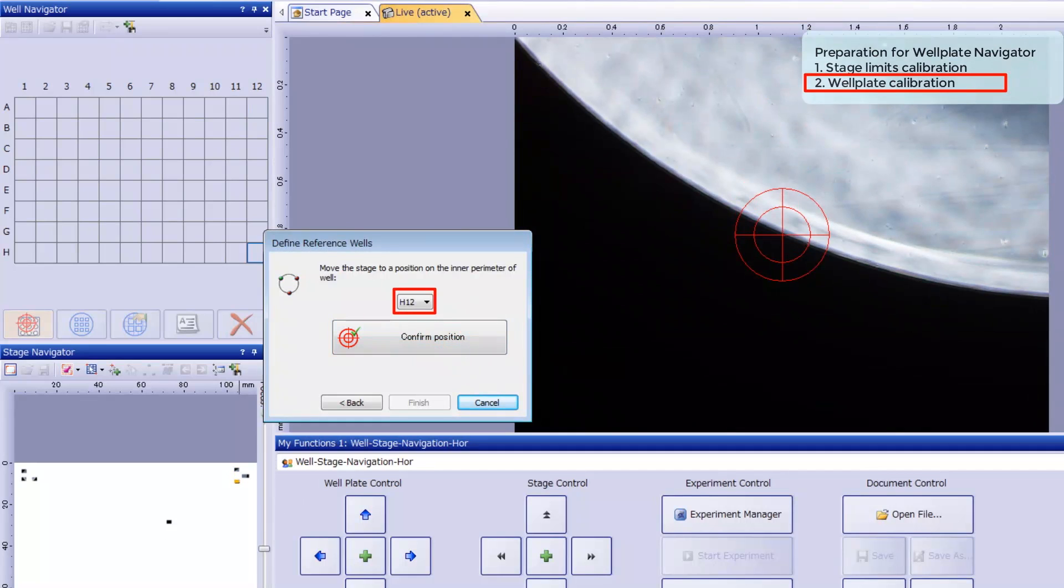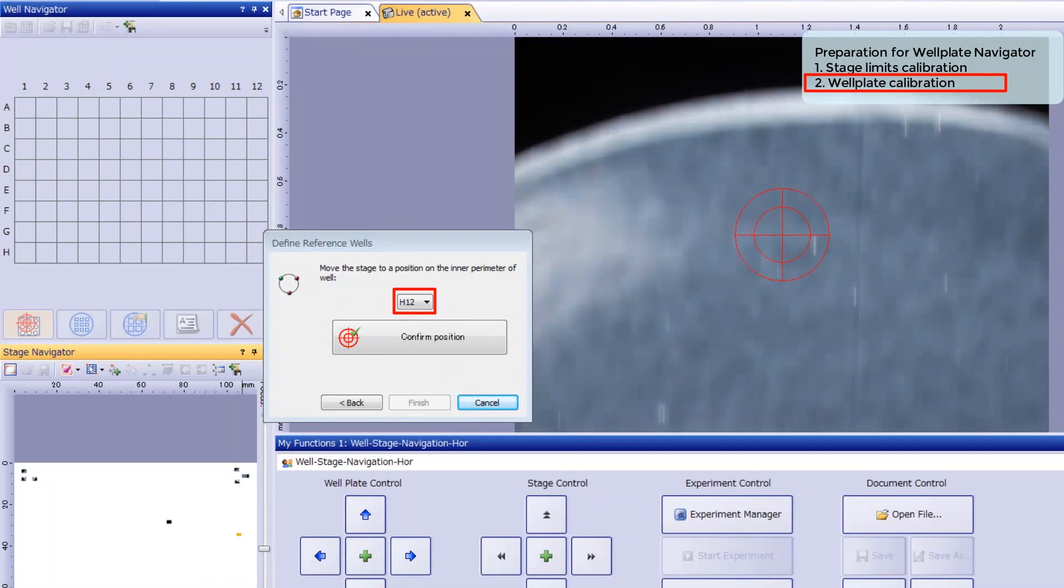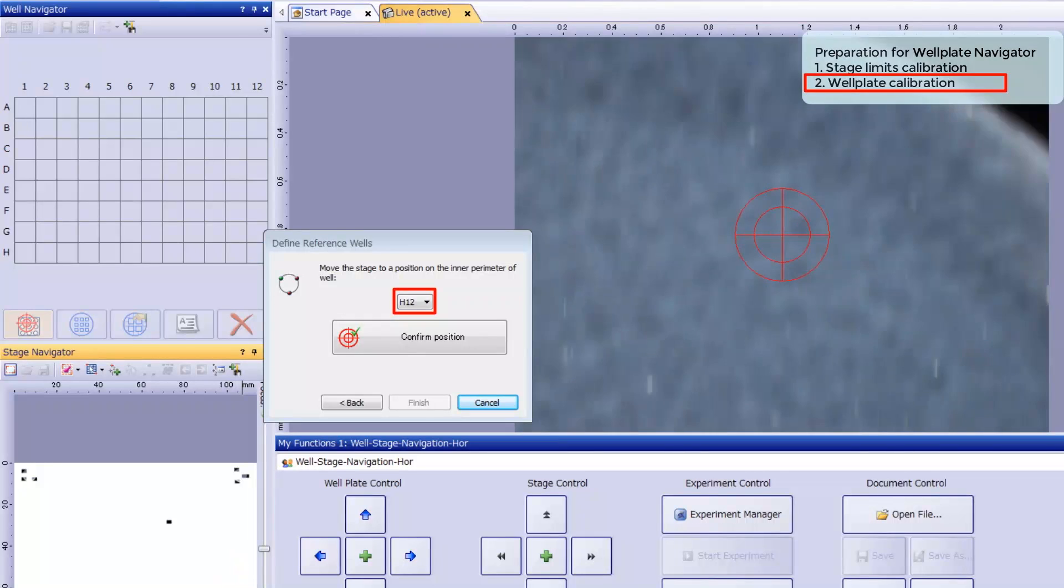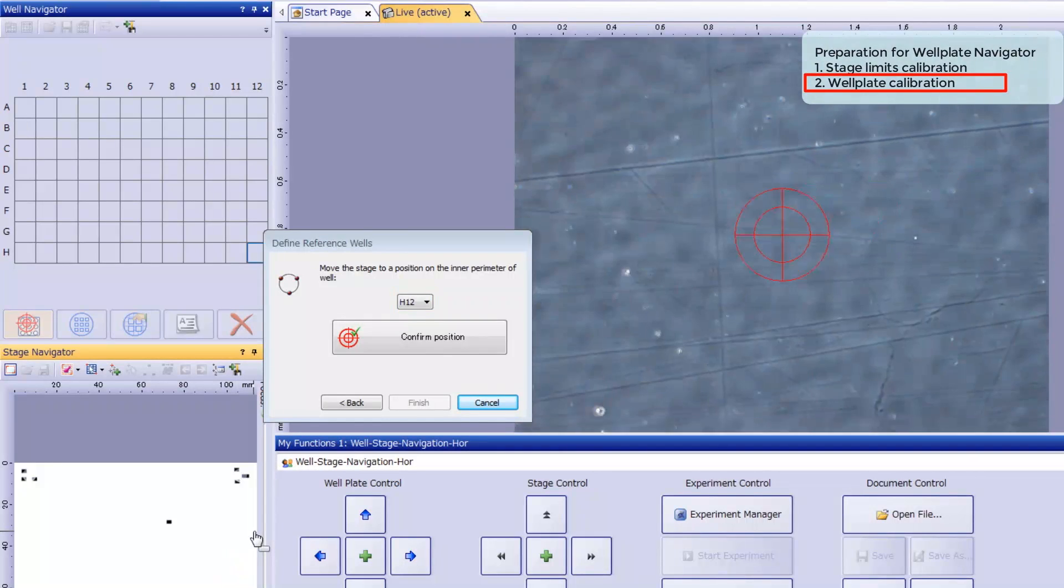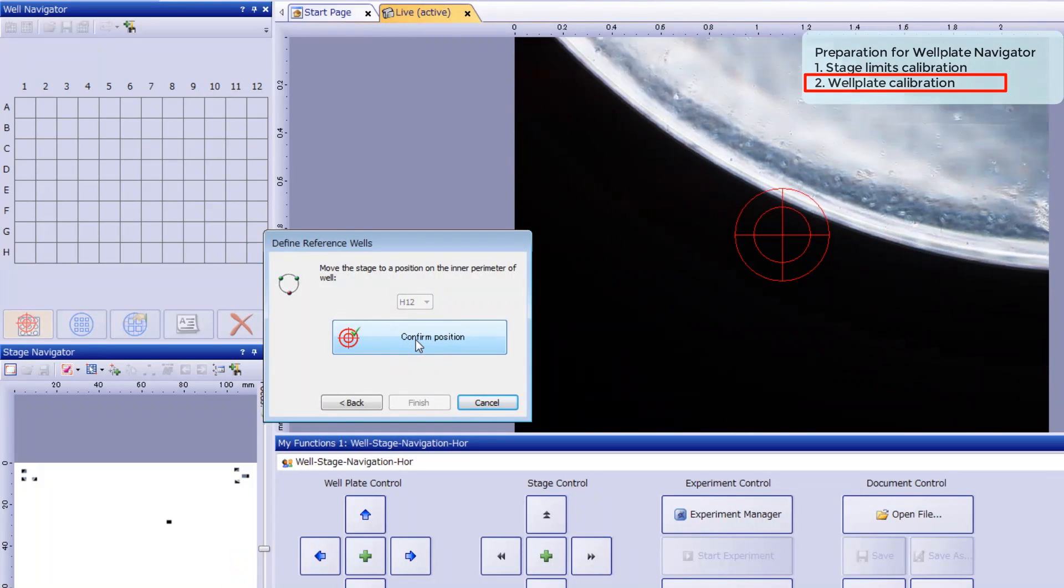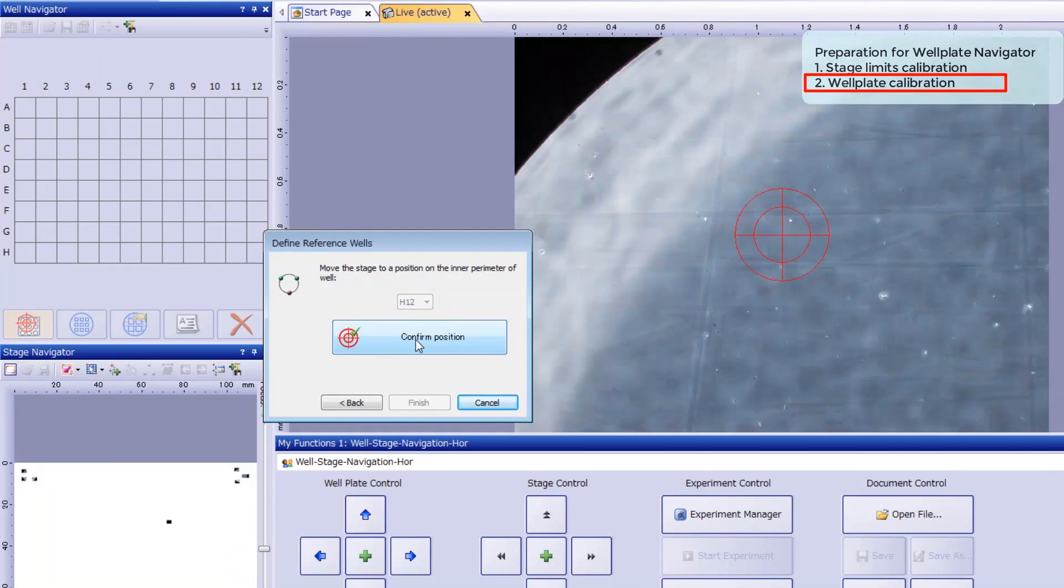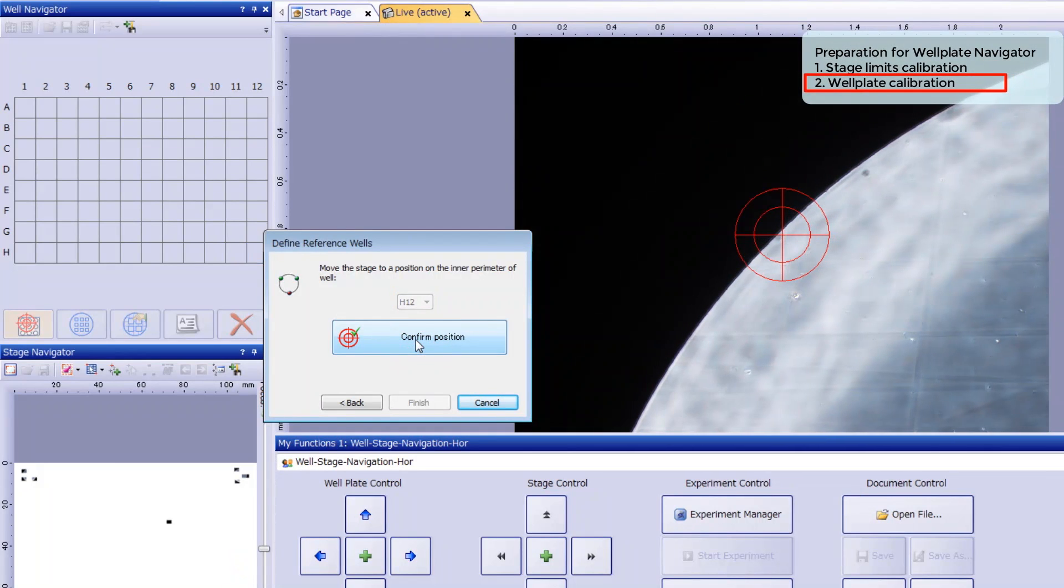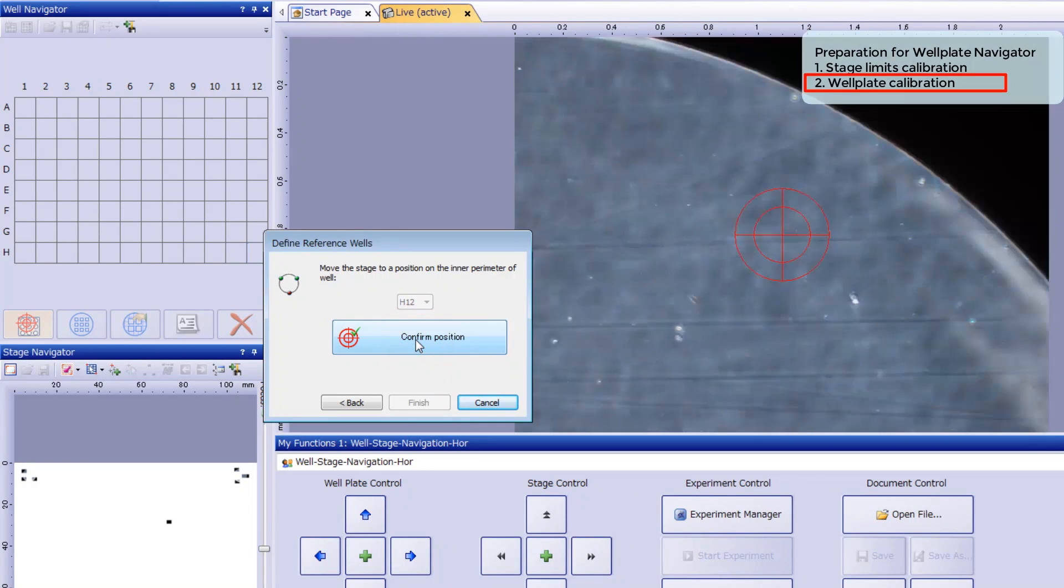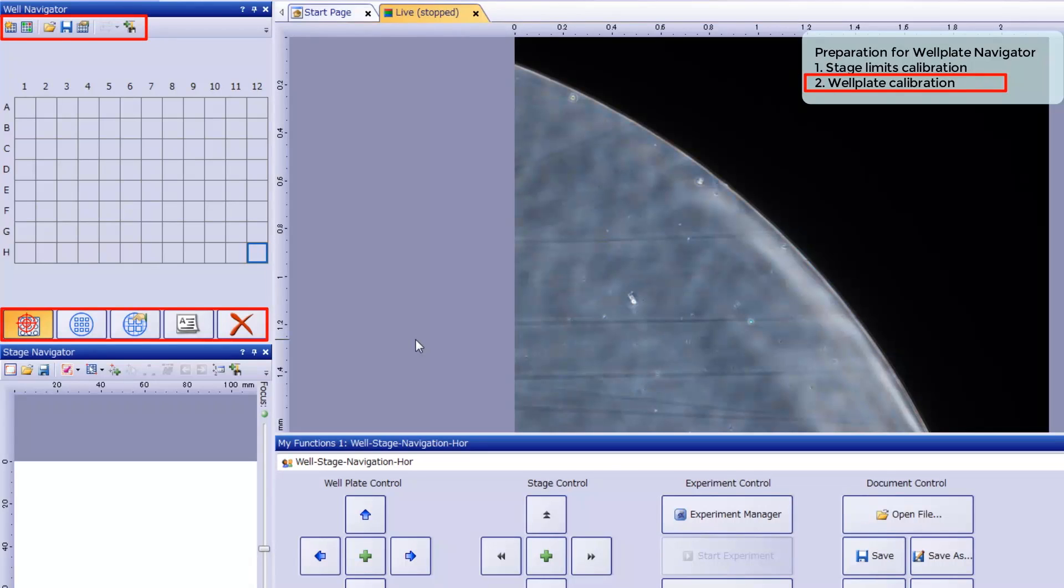Repeat this process in the lower right well, H12. Once you've registered three positions in three wells, the calibration process is complete, and the icons in the well navigator tool window are now active.